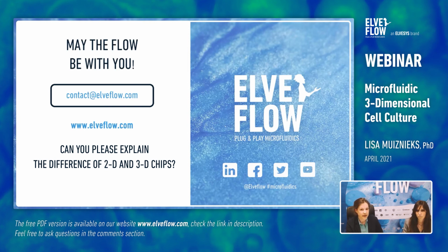The 3D chip, the real advantage is having separated channels that are interconnected with, say, these pillars, so that you can add gel in the center, and then that acts as a barrier between the flow on either side. So I think that would be the main difference between those chips.